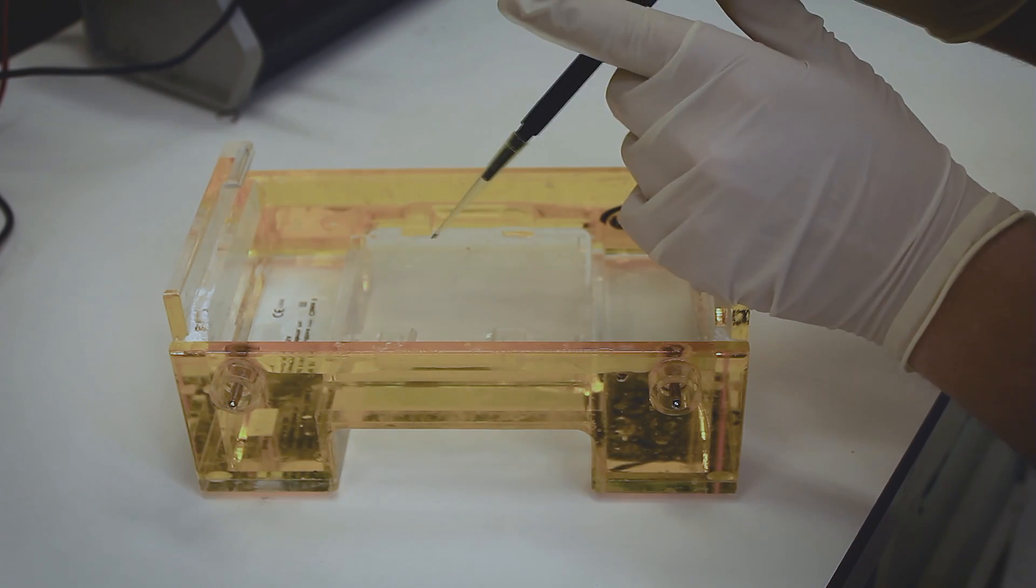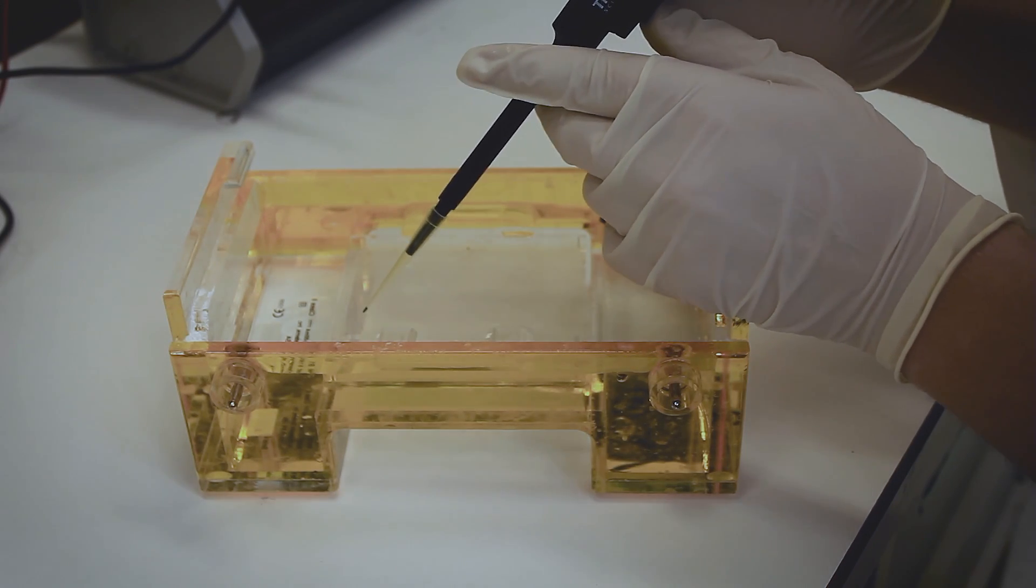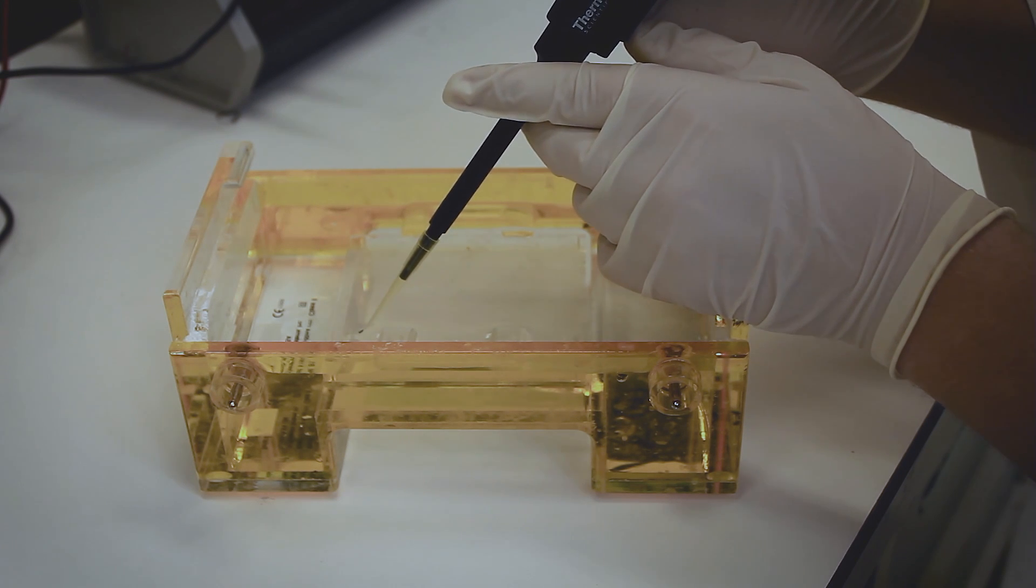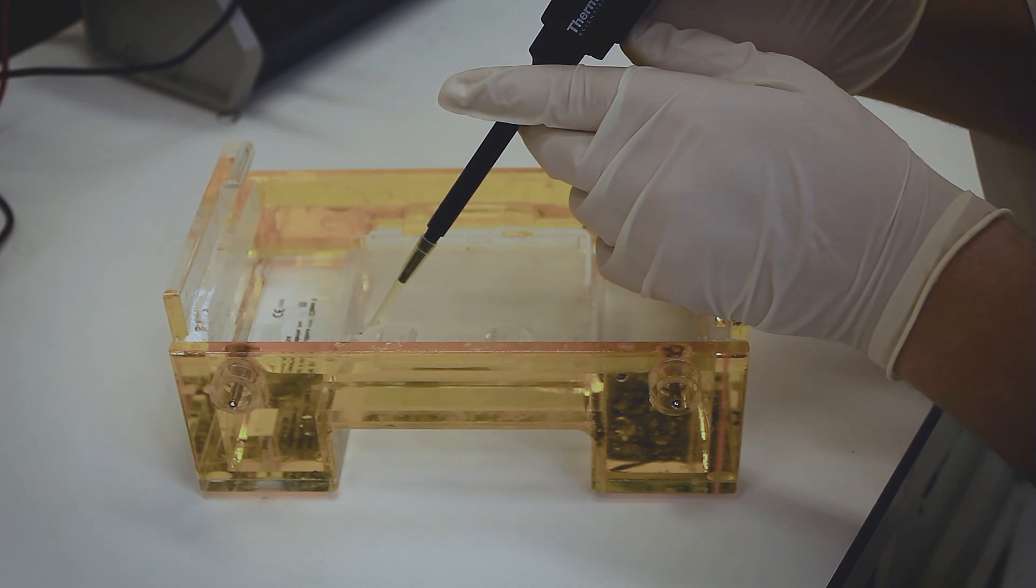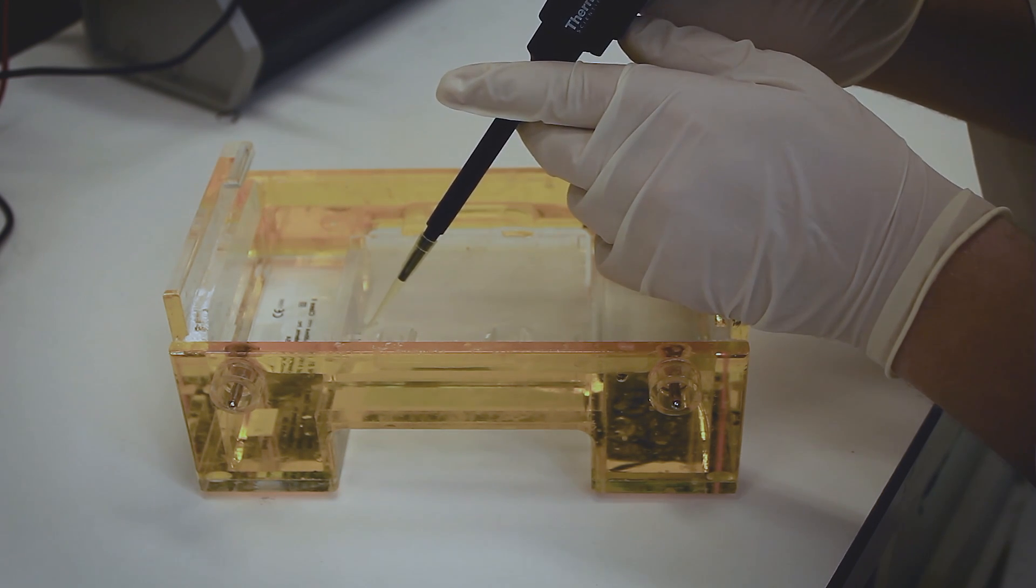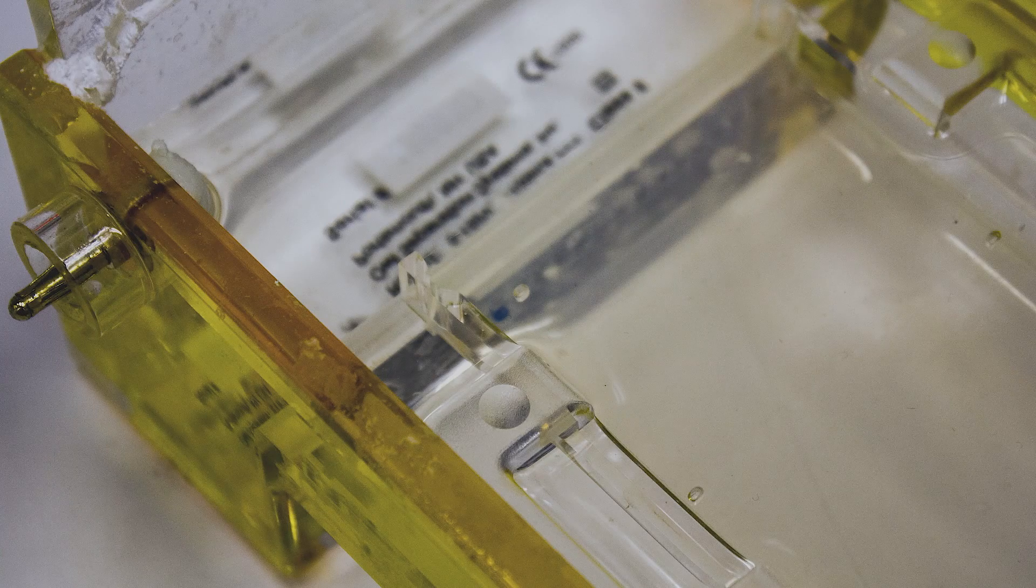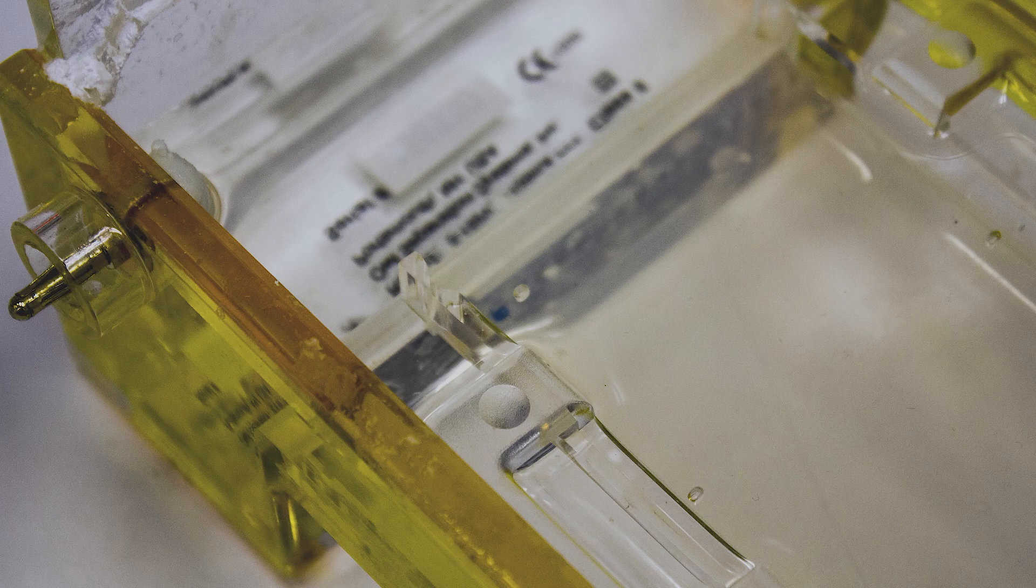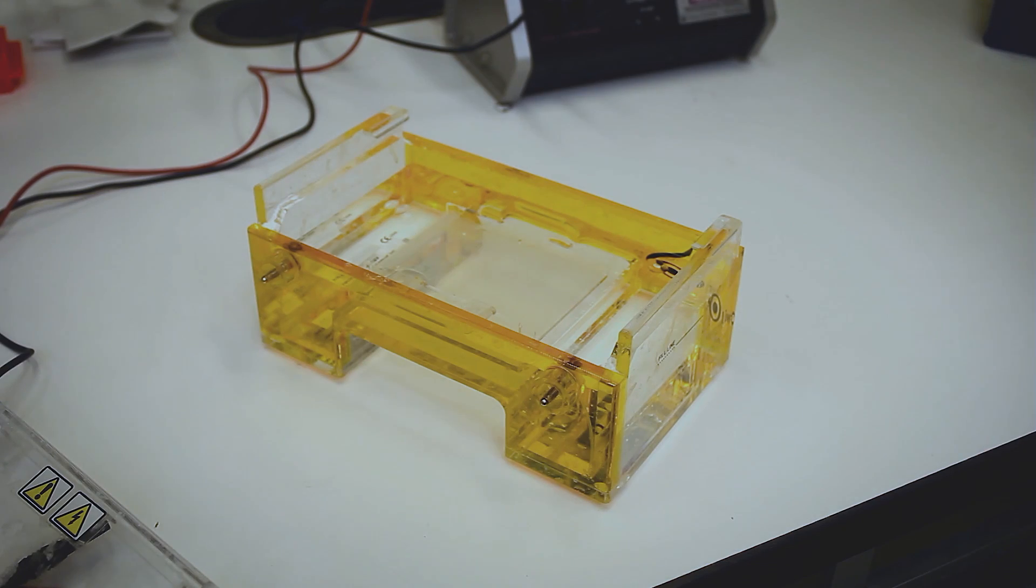Pipette 1 microliter of DNA ladder into the well furthest to the left of the agarose gel. Leaving one space between the DNA ladder and the PCR product, begin pipetting 5 microliters of product into separate wells.